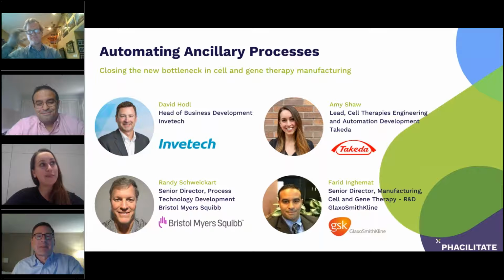I think that for some materials, it can be the stability. Whether you're changing the packaging or, in the case of cytokines, if it's lyophilized or in liquid, the stability becomes a concern. And so there's a whole other data package that might have to be created around that. So that can be some of the pushback that we see. But again, that's something that we would like to help build over time so that it can become more standard in the industry. Okay. Randy? Yeah, exactly. I think that it's the demand. If there's a demand for the materials and the formatting that's appropriate, they will provide it.